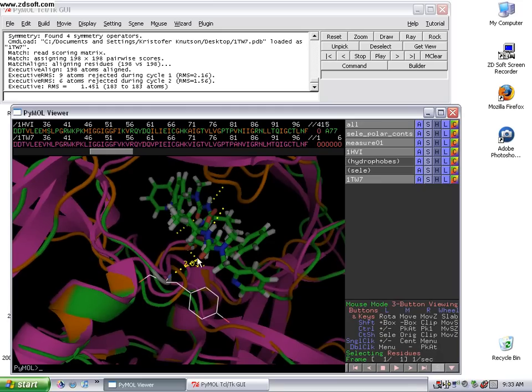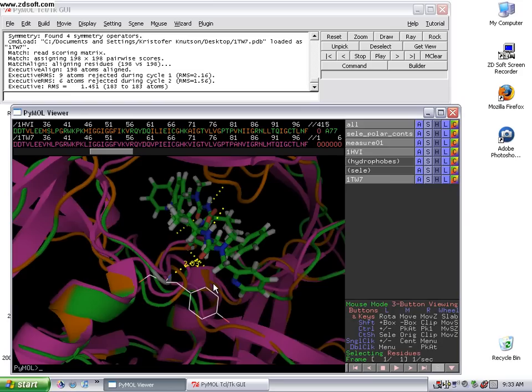Okay, so we've got a decent image, but we have to adjust the fog to get rid of some of the supporting protein. We just want to focus in on this region. Remember, we'll use the scroll wheel to adjust the fog.